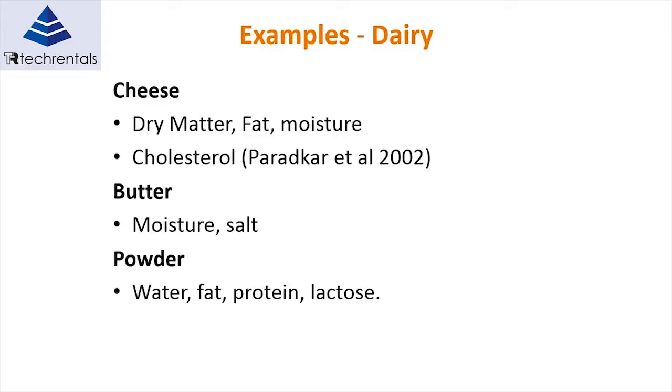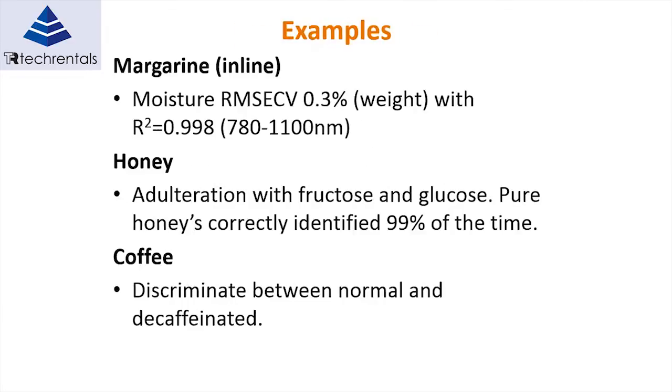Dairy, cheese, dry matter, fat, and moisture. Cholesterol, although cholesterol results from memory weren't that good. Butter is also measured, and powdered dairy for measuring water, fat, and protein and lactose. So you can see there's quite a few examples.